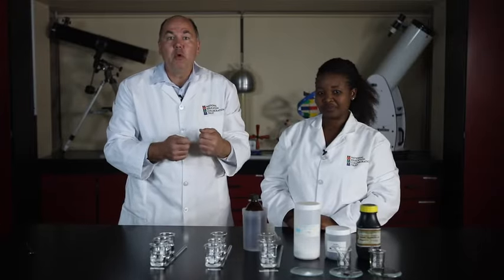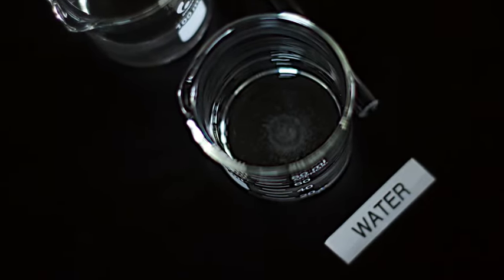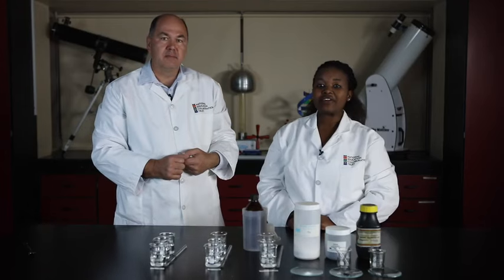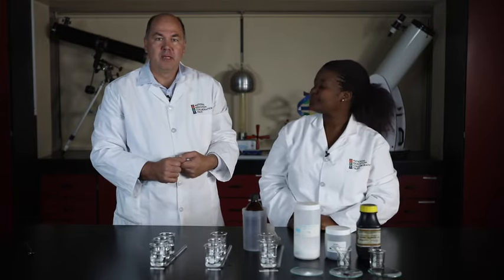Sodium chloride in water in our first beaker. Well, I guess you guys can describe what you see here. Write your observations in the table. Leave the last column blank for the moment. You will complete this table of results when you complete the questions at the end of the video.